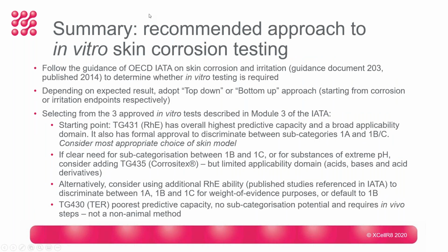So with that in mind, I just wanted to summarise the recommended approach that we would have for skin corrosion testing in vitro based on what I've described today. Please do look up the IATA if you're not familiar with it already. Probably many of you are, but it's important to follow that guidance to determine initially whether an in vitro test is required in the first place.